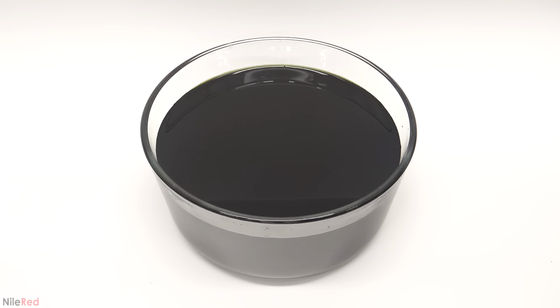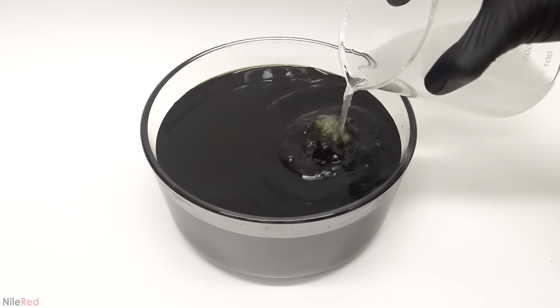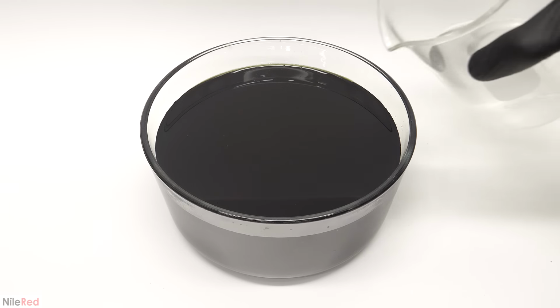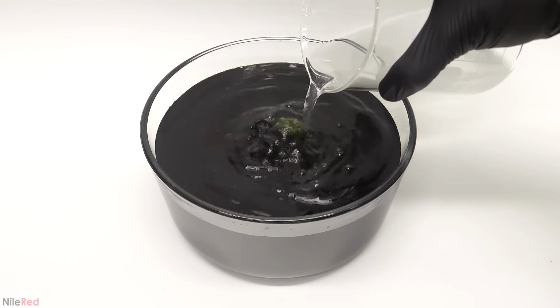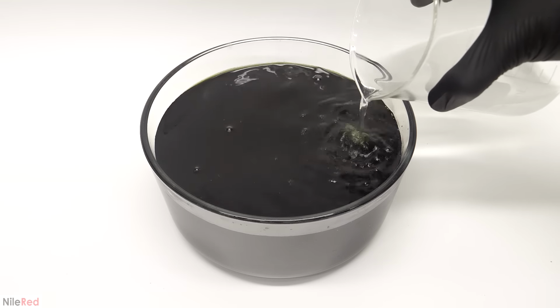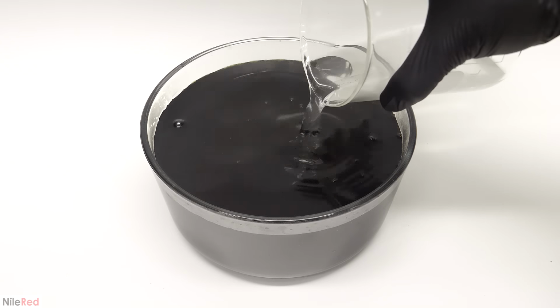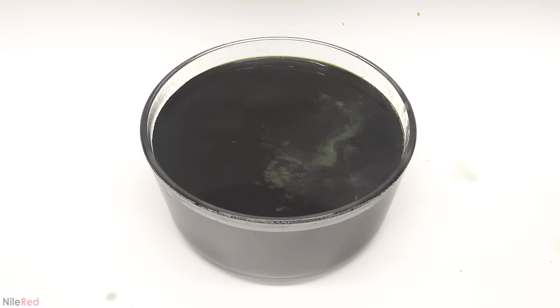To fix this problem, I'd have to neutralize it, and I did this by using a really concentrated solution of sodium hydroxide drain cleaner. This reacted very quickly with any acid that was there, which was mostly sulfuric acid and hydrochloric acid, and it converted them to sodium salts. Doing this, though, generated a lot of heat, and the mixture started heating up quite a bit. It also took way more sodium hydroxide than I expected, and the bowl was getting a bit too full.